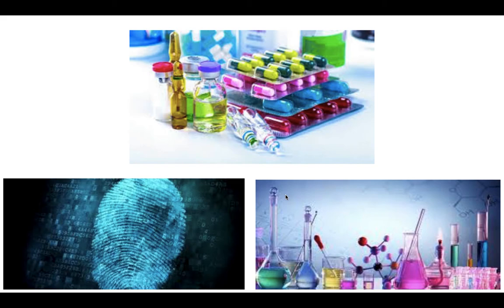There are multiple different applications for HPLC. HPLC has various applications in both industrial and scientific settings, including pharmaceutical, environmental, forensics, and chemicals. In laboratories, HPLC can be used to separate an analyte, a mixture containing two or more different organic compounds, into its individual components so that it can be analyzed.